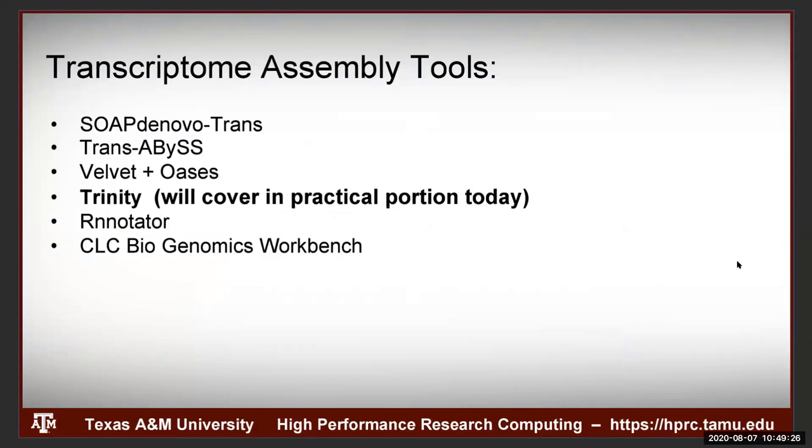Okay, so that is for genome assembly. And we know it's very difficult, but it's still possible to finish. And for transcriptome assembly, it's much easier. And there are a lot of popular tools like SOAPdenovo-Trans and Velvet, Trinity. So Trinity is, I think, probably the most popular one. And it's not just a transcriptome assembly tool.